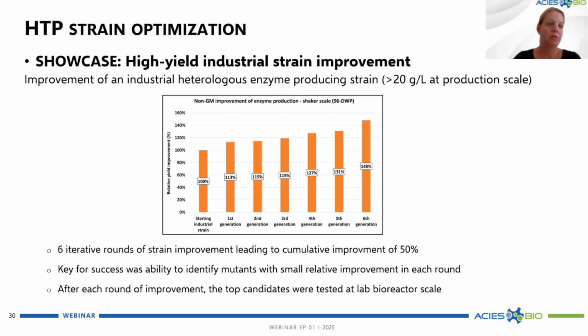So you usually start with a starting strain that has some desired trait that is low. It can be growth rate or maybe resistance to something. And then you do subcultivations under relevant conditions. What is really important is the relevant conditions. They have to be set up in a way that you select the right strain at the end.